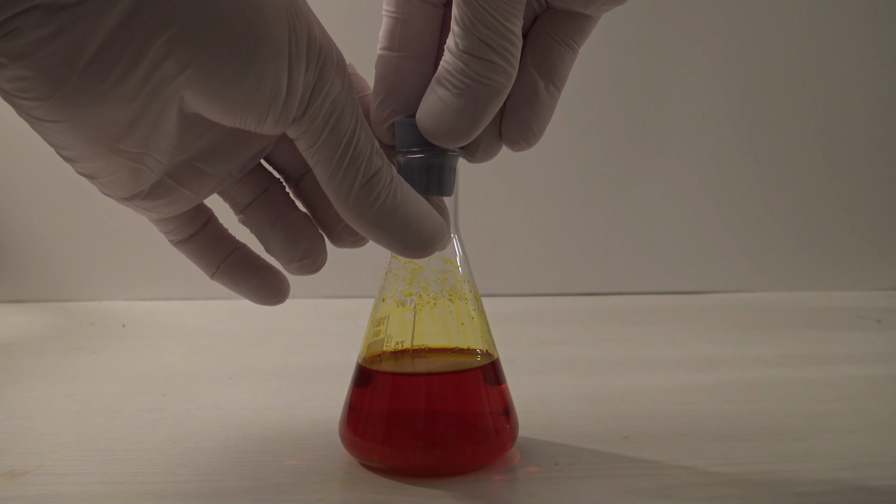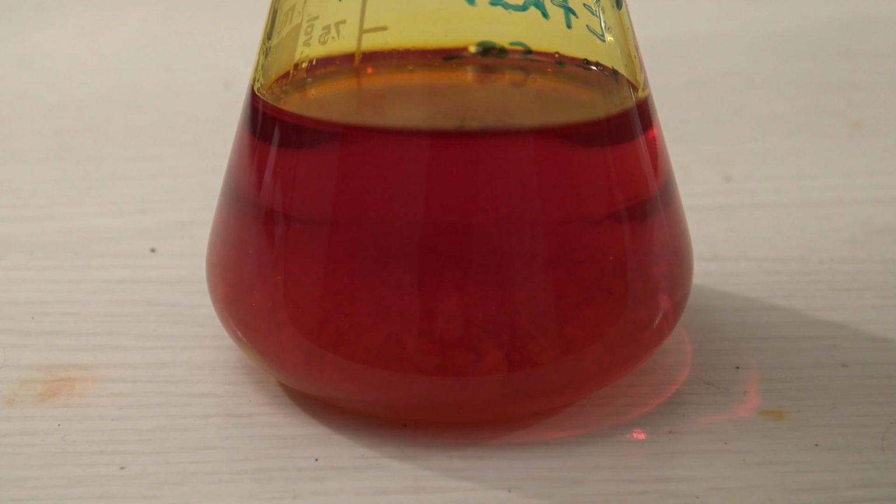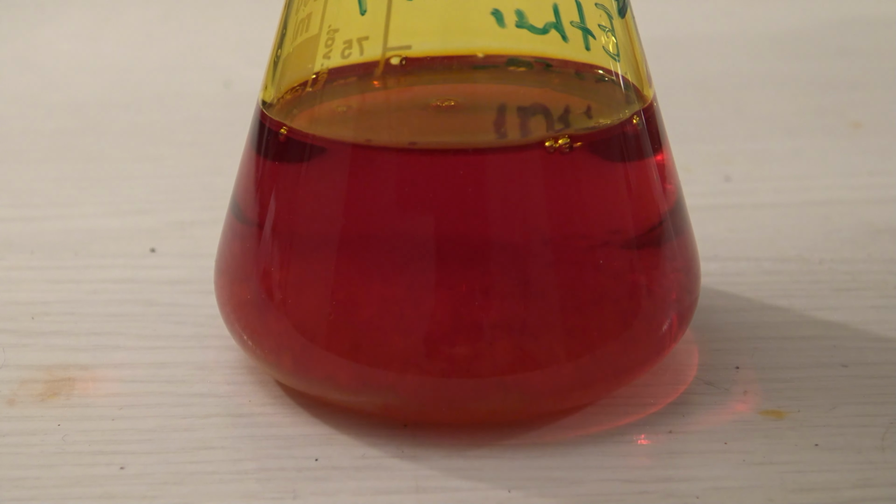The flask was closed and left to sit overnight. It can also be checked after 15 minutes if the mixture is dry, and if not, more sulfate can be added.